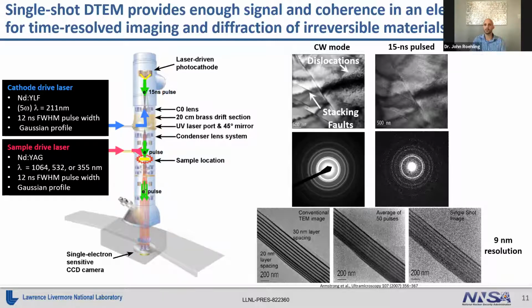So you need a sample that reacts exactly the same, and the laser drive needs to be very repeatable, which typically it's difficult to do. So what you want is something that can image just a single process multiple times and get that time evolution without needing to move to different parts of the sample. This just opens up a lot more experiments.